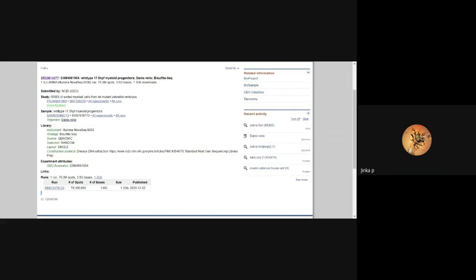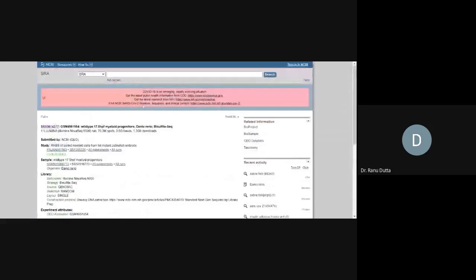Maybe you can send this link, ma'am. Actually, I'll try to download and extract how much it will come to. We can see 1.3 GB. Just type this, zebrafish. So this is one experimental model, my favorite model. It's a fish. Yeah, click on show abstract.